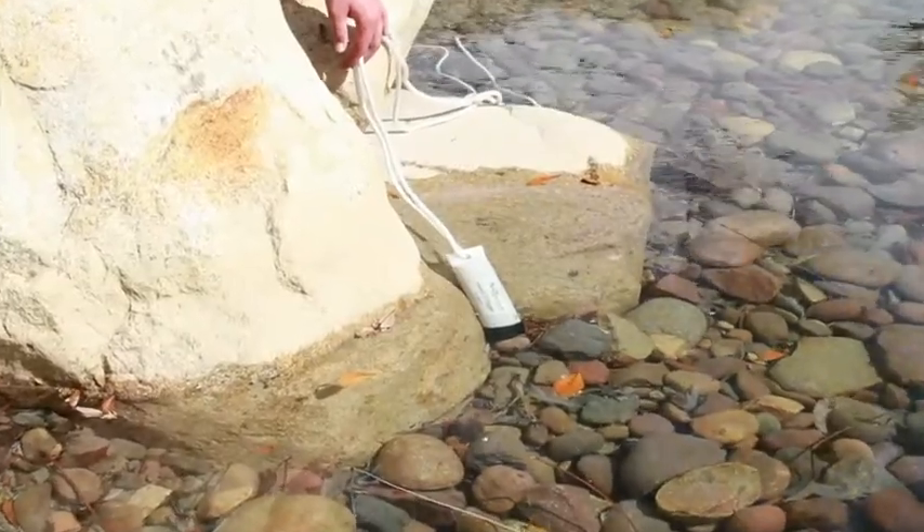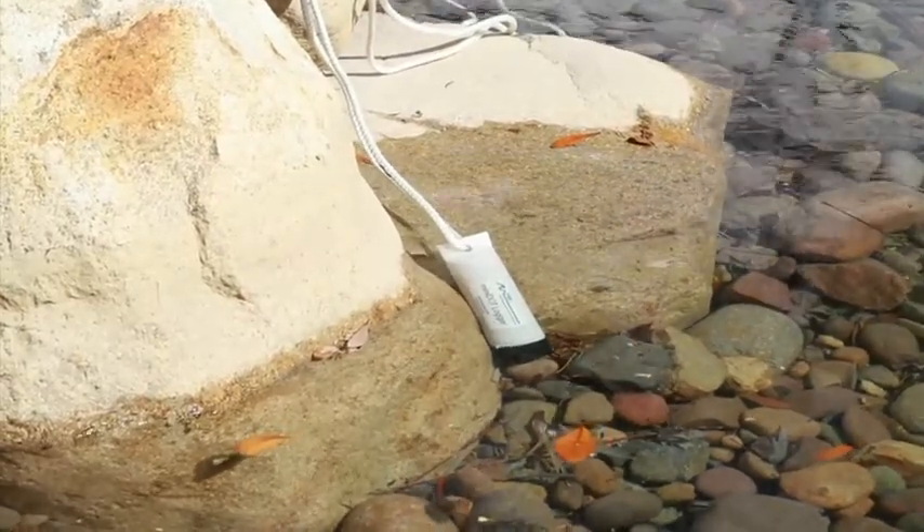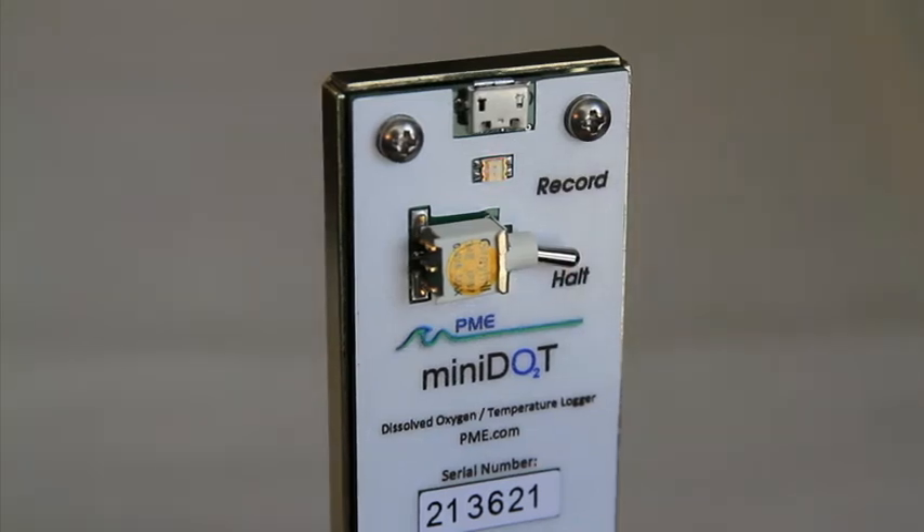After deployment, dry off the mini dot logger and then unscrew the white case. Turn the switch to HALT. This means that recording has stopped and the LED light will flash red five times.